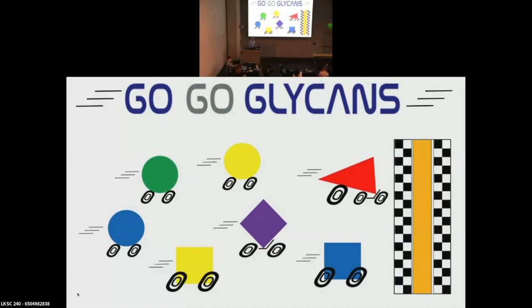But we are getting that kind of data after we do that PNGase step, because now we know which site they were being carried on, and we're starting to see that. The problem is we've only done it on a handful, so the tissue above it, which isn't tumor, is different than the tumor for those two types of glycoproteins. I'm sure we're going to see it, but it will come with the data.